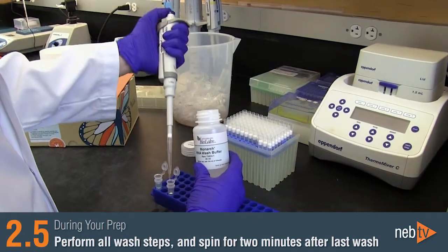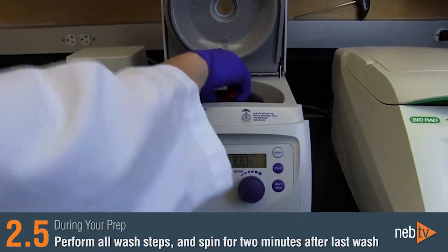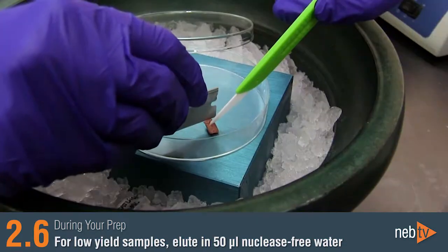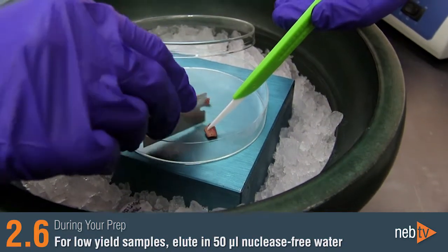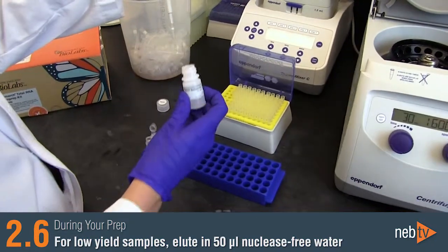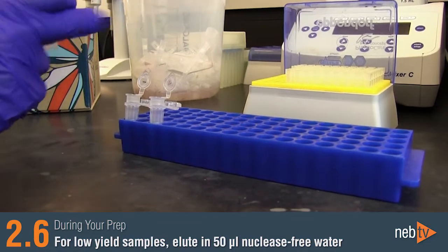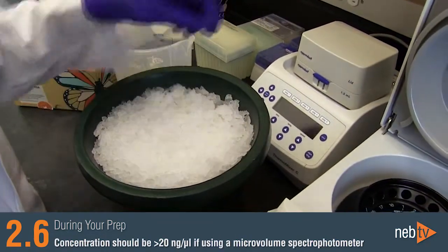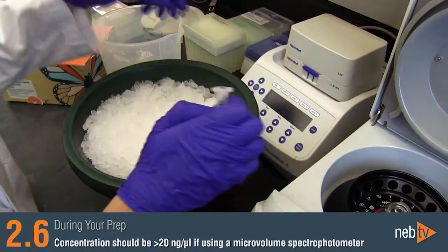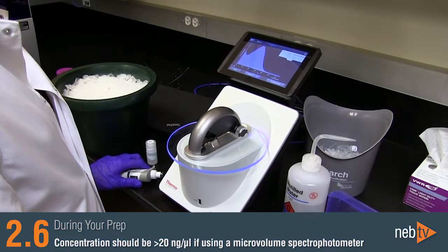It's very important to perform all wash steps in the protocol in order to produce highly pure RNA. Be sure to spin your column for 2 minutes after the last wash. For low-yield samples, including muscle or brain, or for low starting inputs, consider eluting the RNA with 50 microliters of nuclease-free water in order to get concentrated RNA. It's important to have a concentration above 20 nanograms per microliter if a microvolume spectrophotometer, such as a NanoDrop, will be used to measure concentration and purity.